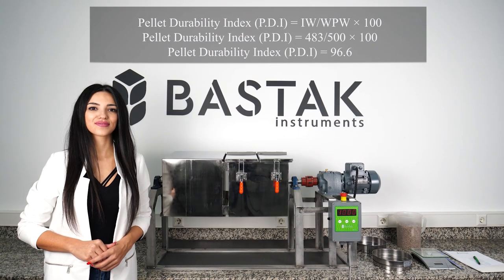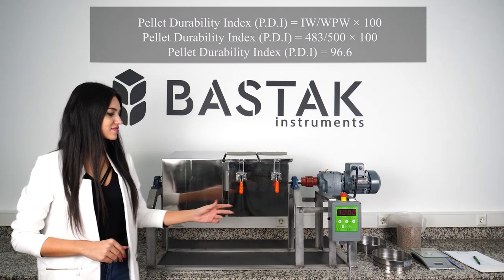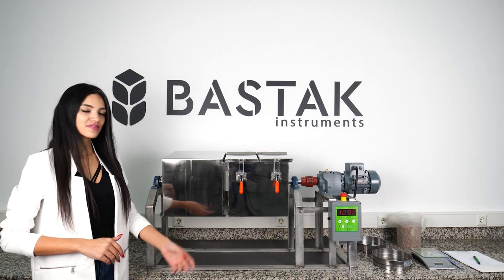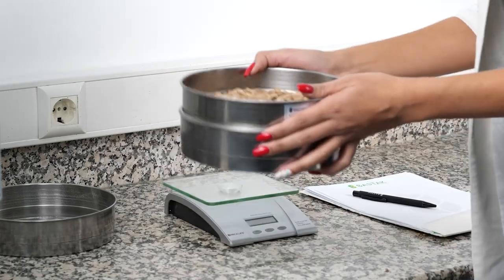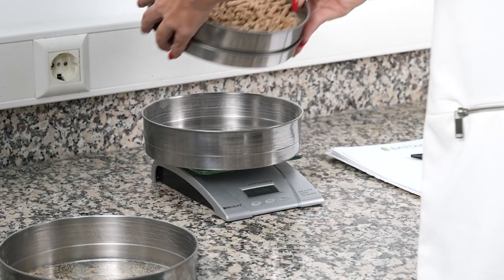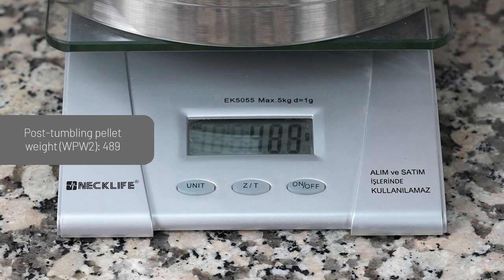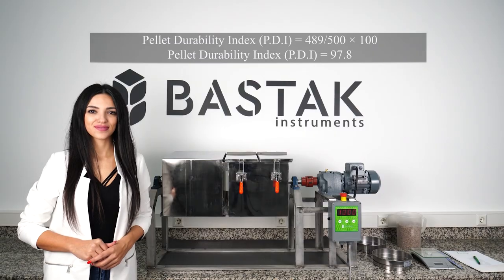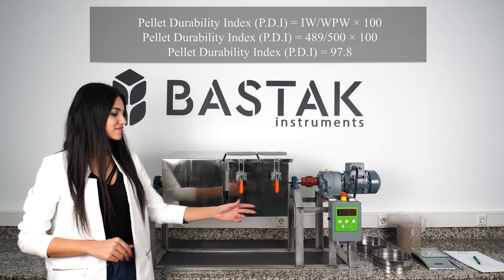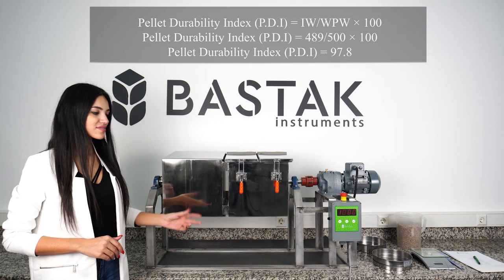The weight of the pellet, measured after rolling the sample, is divided by the initial weight of the sample, and the result is multiplied by 100 to calculate the pellet durability index, PDI. The same measurement process is applied to the other sample as well. After rolling, the weight of the pellet is 489 grams. By dividing the pellet weight measured after rolling by the initial sample weight, then multiplying by 100, the pellet durability index, PDI, is calculated.